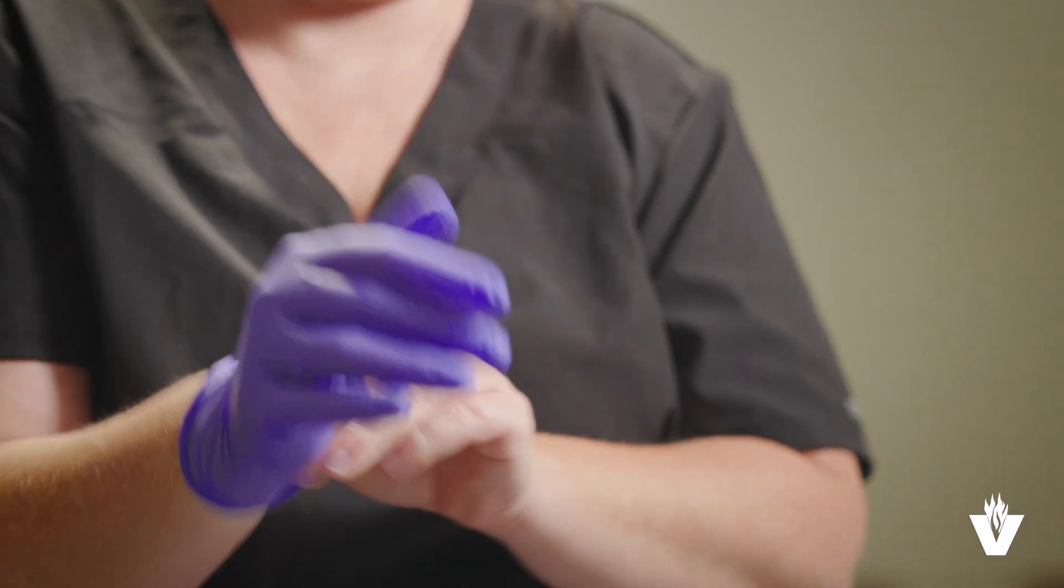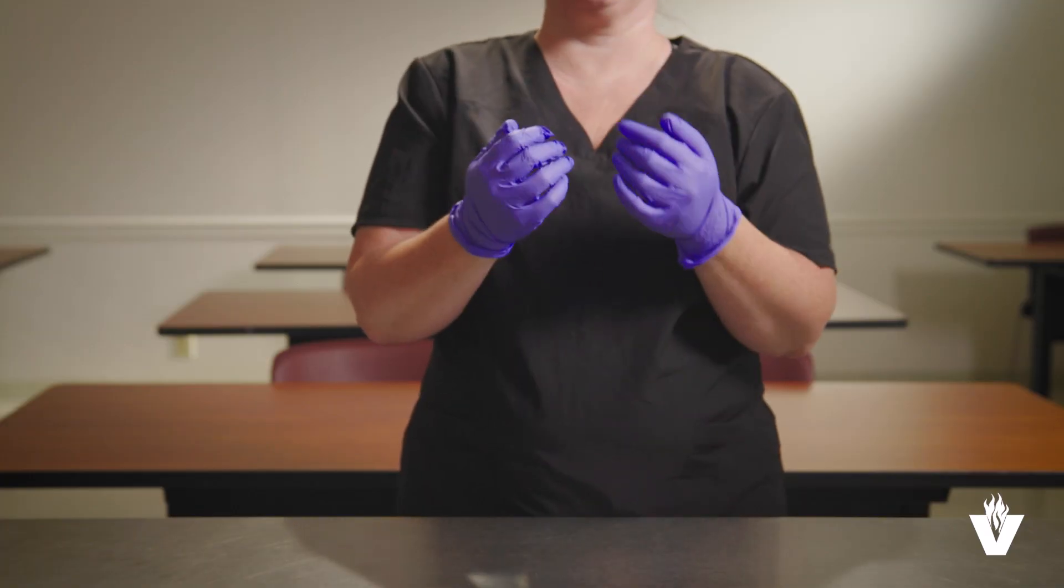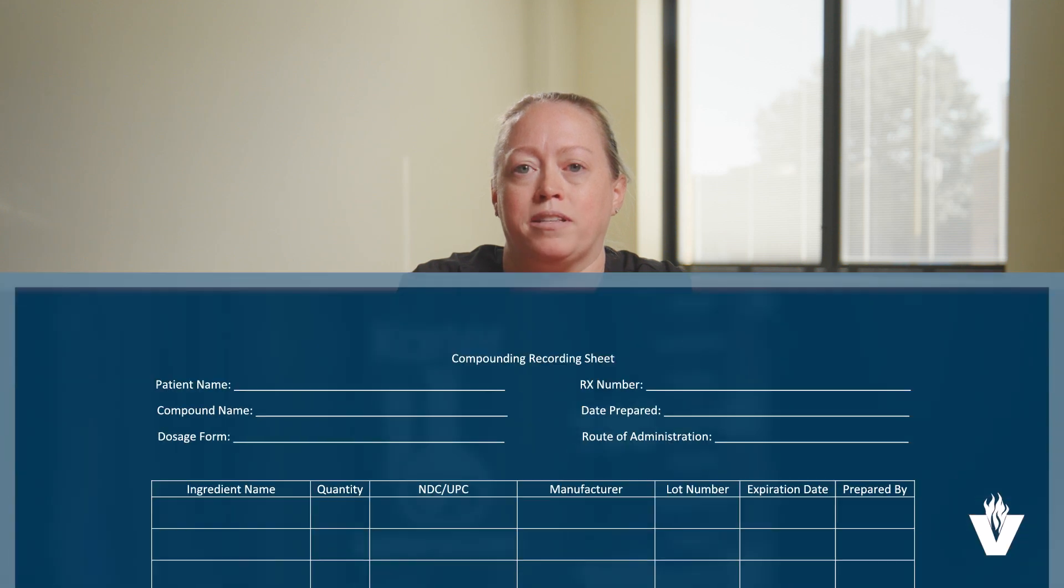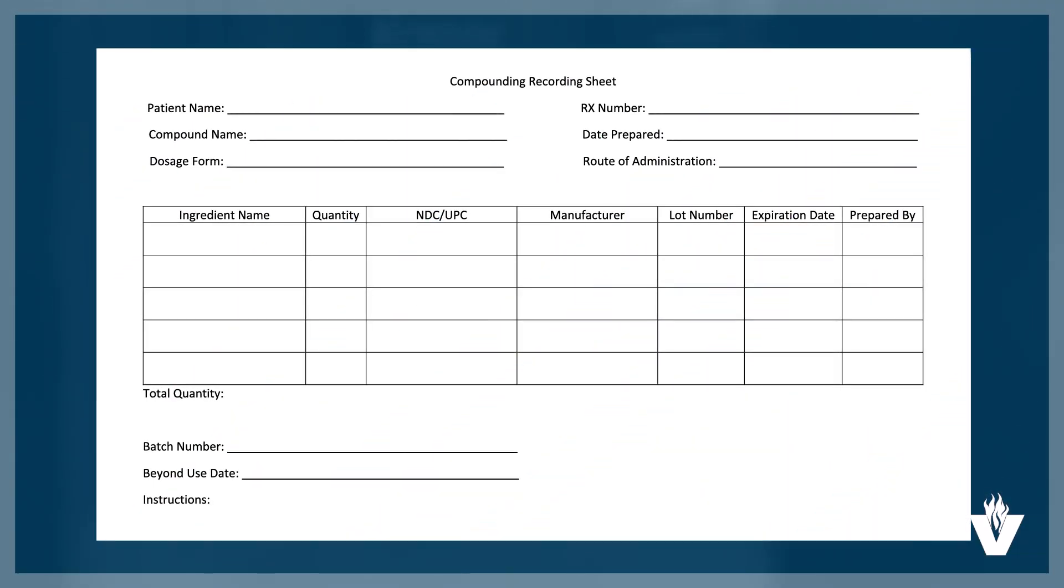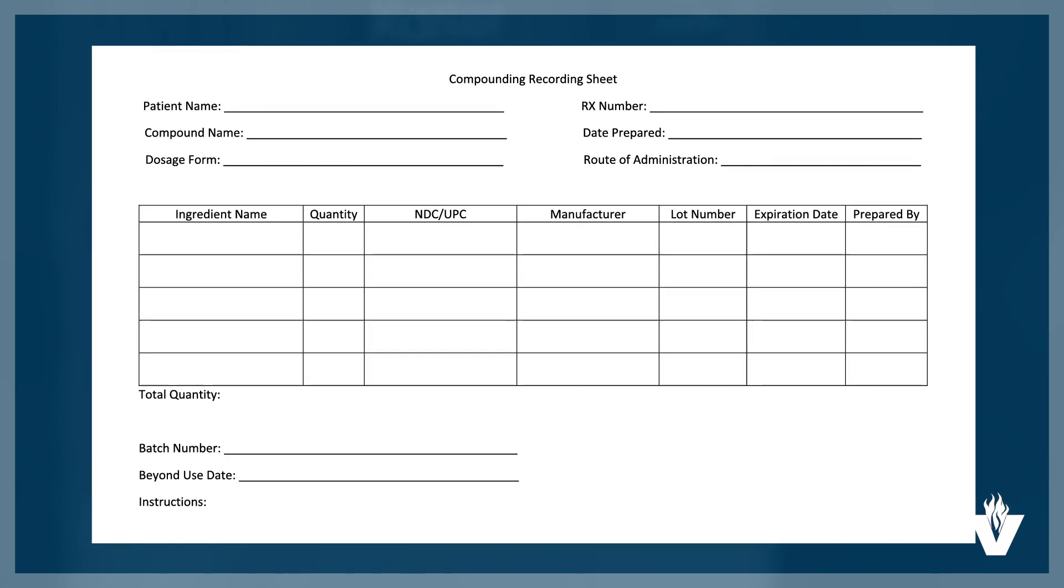First, you will need to wash your hands thoroughly and put gloves on. We will be weighing out the powder active ingredient and base ingredient. You will need to weigh out the correct amount of powder needed for the recipe based on the calculation and compounding sheet.